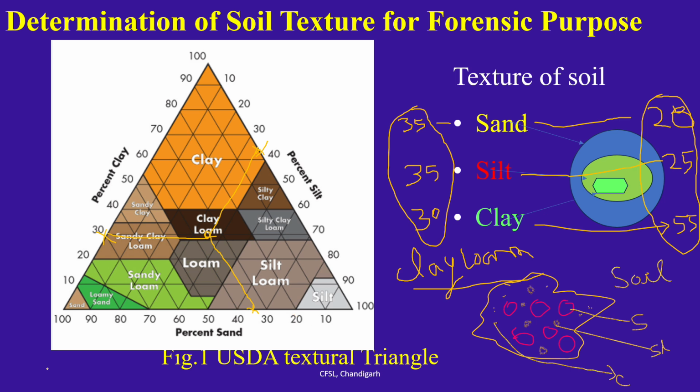So fix the first coordinate at 20, here. We follow this line, and silt is equal to 25. Silt is here, equal to 25.